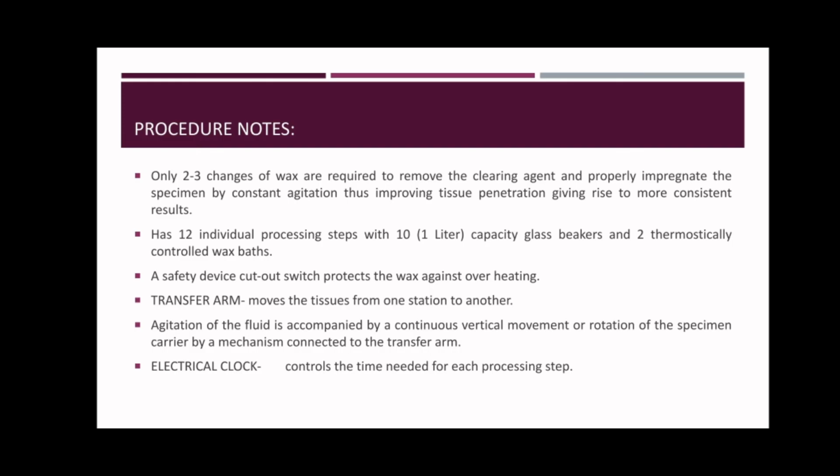There is a continuation of agitation of the fluid that is also accompanied by a continuous vertical movement or rotation of the specimen carrier by a mechanism connected to the transfer arm. If you can remember from the video that I have shown you a while ago, that is how they agitate the fluid. There is a continuous vertical movement and rotation going up and down from one glass beaker to the other until it finishes all the 12 processing steps.